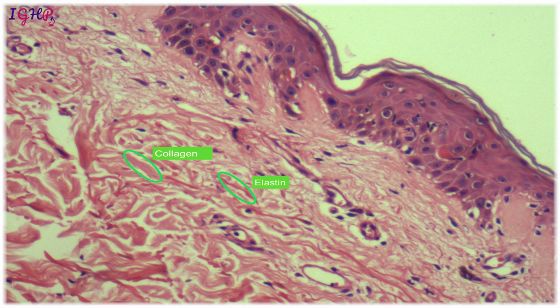Now there should be something to produce these elastin and collagen fibers. They do not just come on their own, they require some cells to produce them. And what are those cells? Those cells are these fibrocytes. So they are being produced by the fibrocytes, and these are the small spindle cells that we see here, and these are the cells that are producing this collagen as well as these elastin fibers.